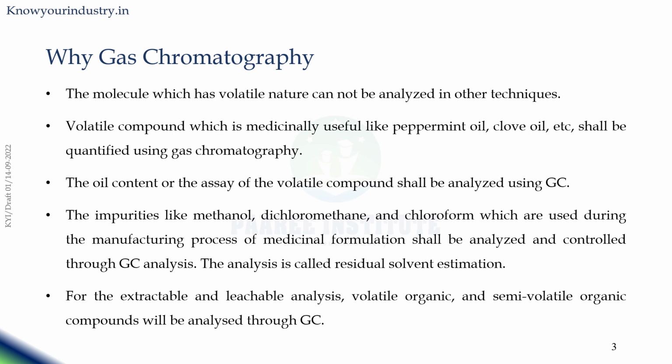What is the importance of gas chromatography? Why is gas chromatography required? Molecules or compounds which are volatile in nature are very difficult to analyze by analytical techniques like HPLC or any other technique. Those compounds which easily become volatile, like solvents having a very low boiling point, can be analyzed by gas chromatographic techniques.